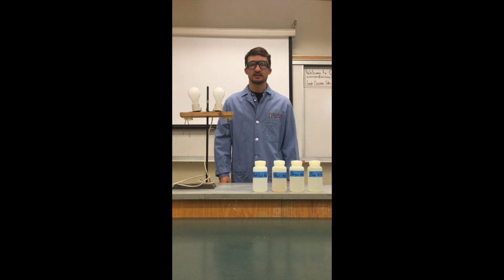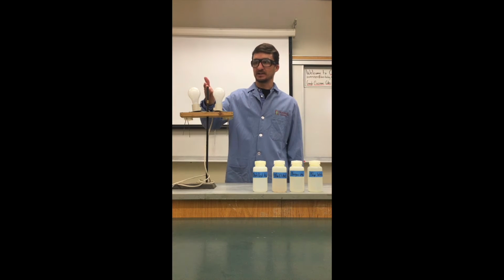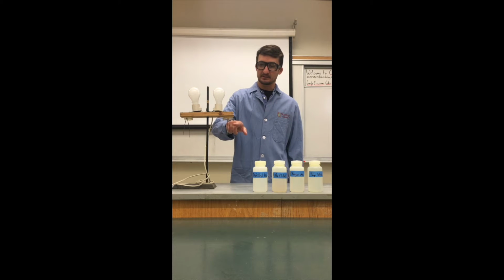Rosen here. Today we're going to be thinking about the conductivity of solutions and just a little bit about our setup. Here you can see we have a ring stand and there are light bulbs. Okay, now these light bulbs, they are plugged in, and we have a cord here which is plugged into an outlet, and hanging down you can see two wires.